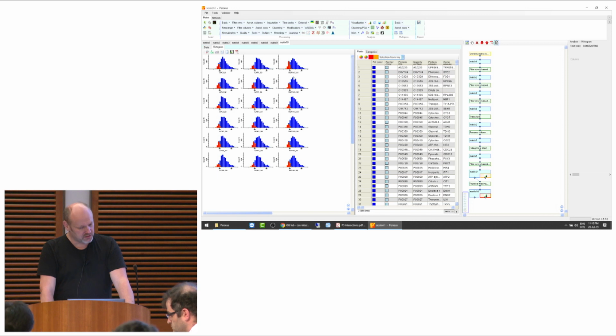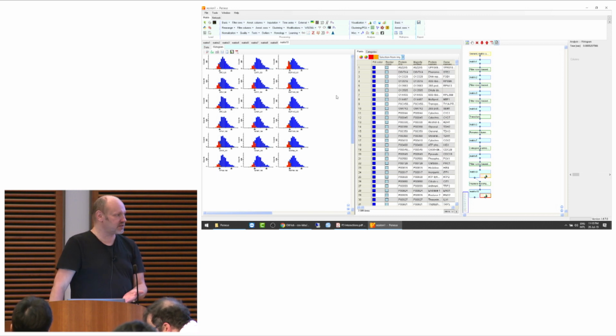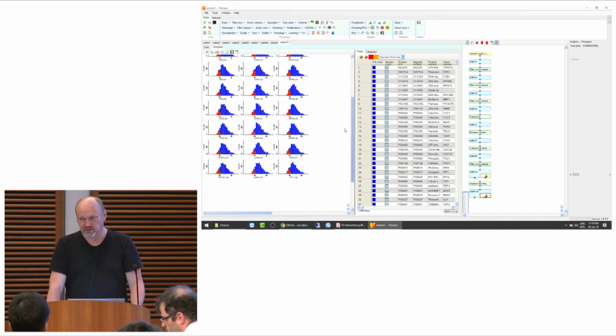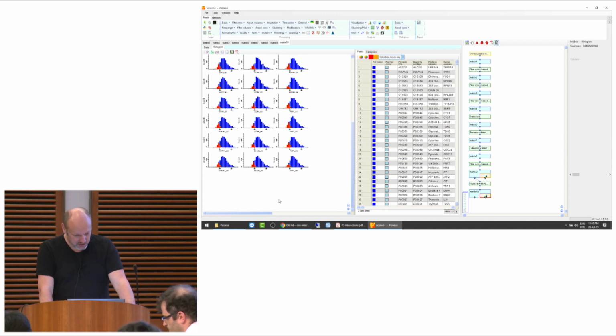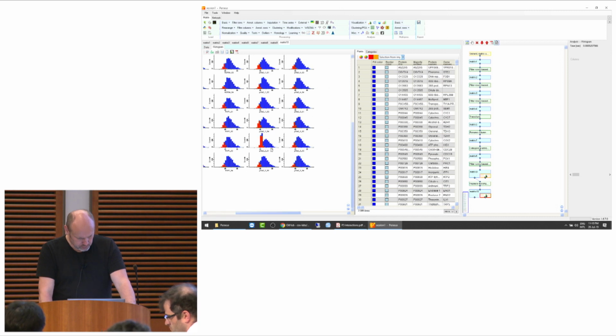Other thing is, it also looks good in terms of the fraction of the imputed values is not so huge, right? So this is like, I don't know, 10% of the data or something like that, it looks like. So that's not going to disturb your data much, basically. And so in general, it looks good.